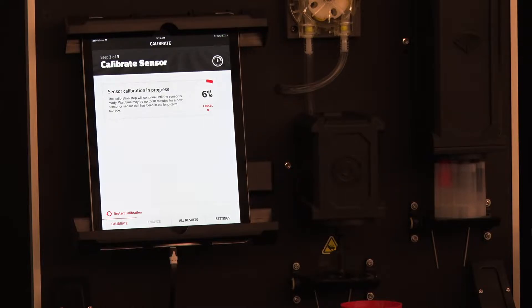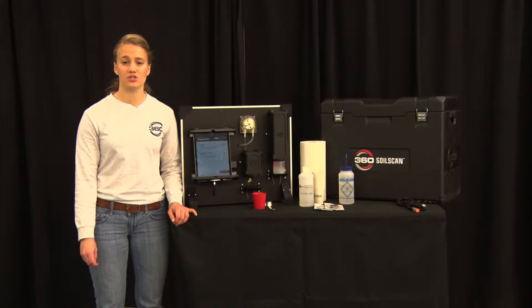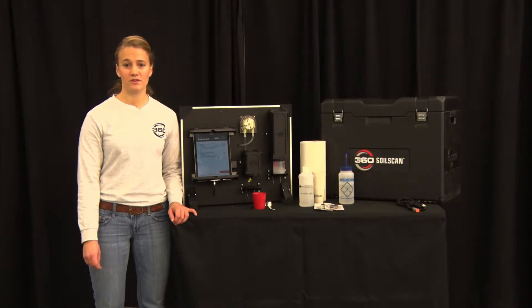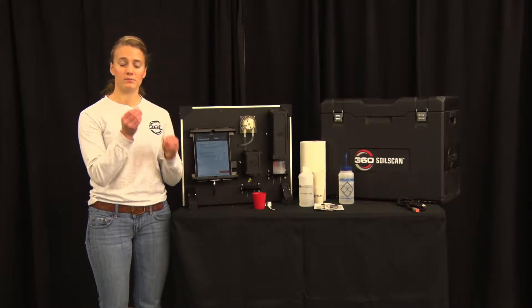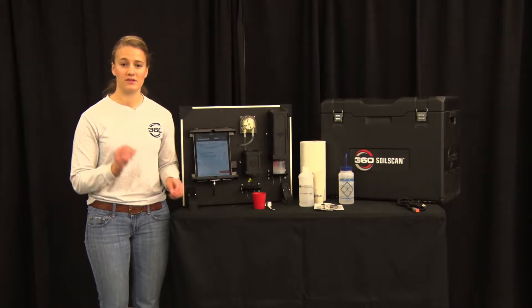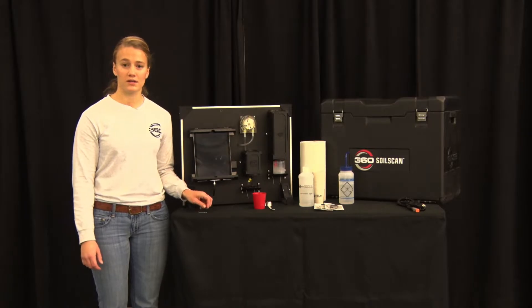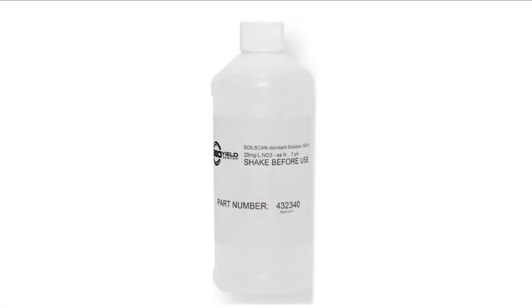It is recommended to replace the red reference sensor and the gray nitrate sensor every year. If the sensors are having problems calibrating there's a couple steps that you can take. Allow the sensors to soak in the nitrate solution a while longer, up to 24 hours if need be. Ensure that the sensors have a good connection. You can do this by unscrewing the sensor and using a paper clip to pull the tab down to ensure that the tip of that sensor is in good connection with the tab. You will also want to ensure that you have fresh nitrate solution.